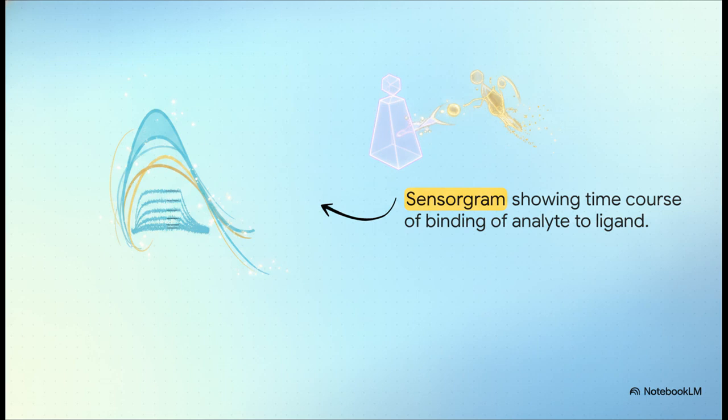The system continuously plots that shifting SPR angle over time to dynamically form these elegant curves, called sensorgrams. The vertical axis is measured in response units, or RU. To put that into perspective, just one single RU represents a shift of 1/1,000,000th in the refractive index. It's unbelievably precise.